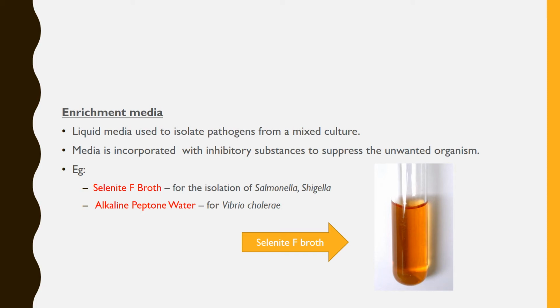So if you want to differentiate between enriched or enrichment medium, you can say the enriched media is used to grow required microorganism without inhibiting the unwanted microorganism, and it is in the liquid or solid form mostly.